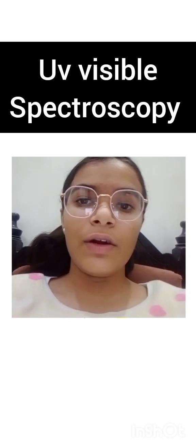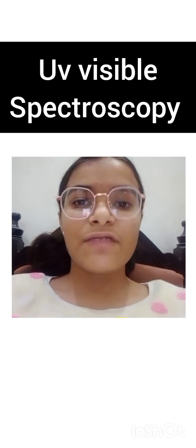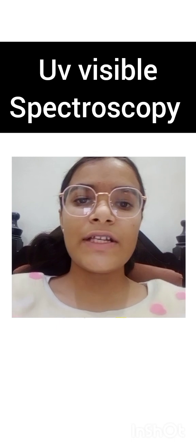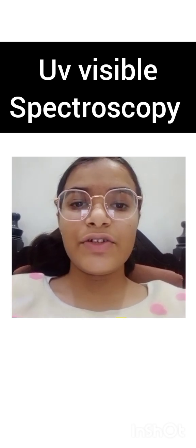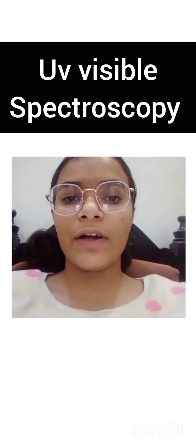As we know, it is molecular spectroscopy that involves the study of the interaction of ultraviolet and visible radiation with molecules. Ultraviolet and visible light have just the right energy to cause an electronic transition of an electron from one filled orbital to another, higher energy unfilled orbital.